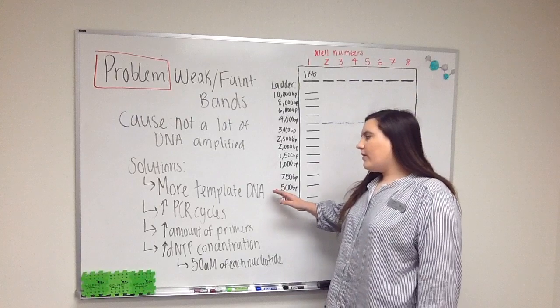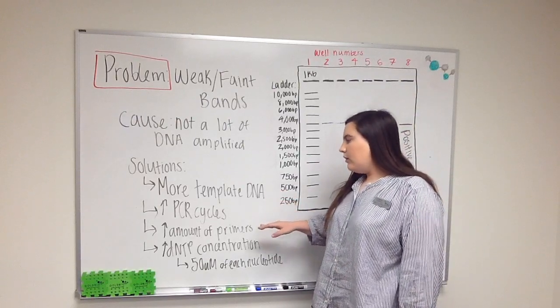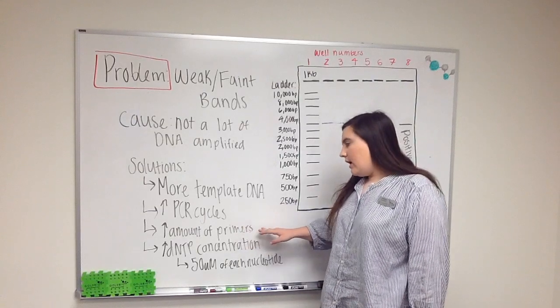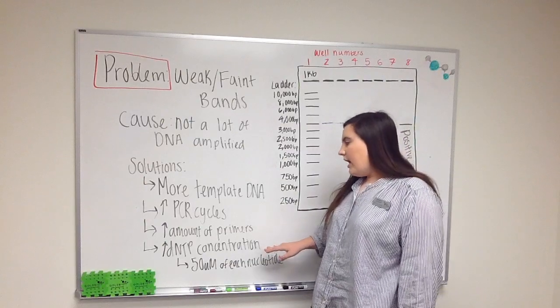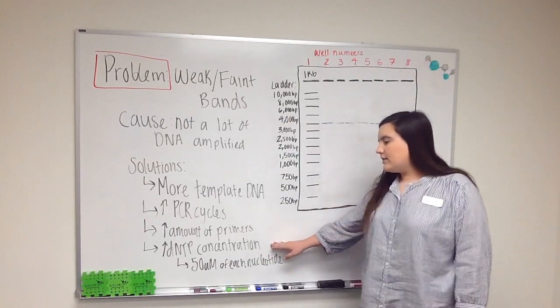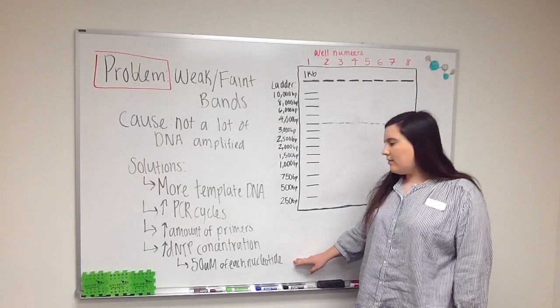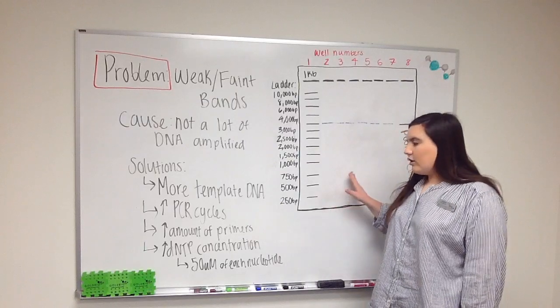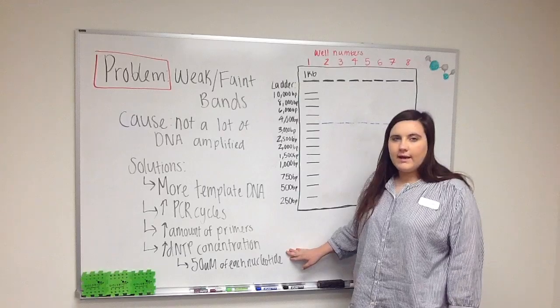Some solutions for this is that you might need to add more template DNA. You could also try increasing the amount of PCR cycles. Another thing you could do is increasing the amount of primers you use and you may also need to increase your DNTP concentration. The standard DNTP concentration is usually around 50 micromolars of each nucleotide. If you're trying to amplify a large sequence though, you might need more than 50 micromolars of each nucleotide.